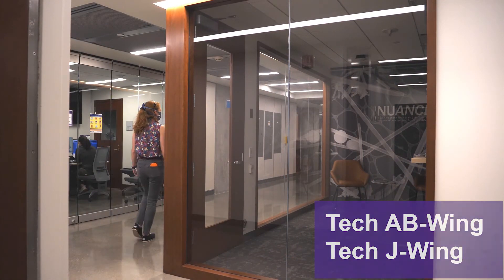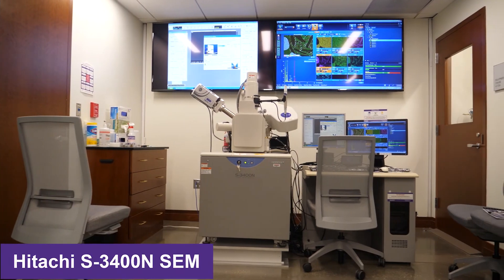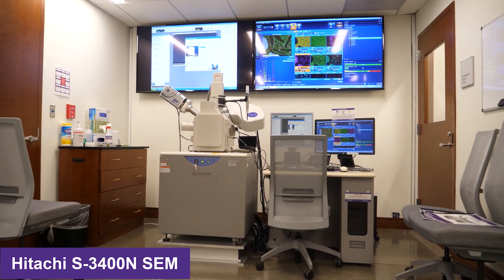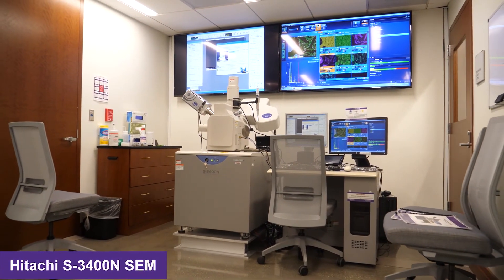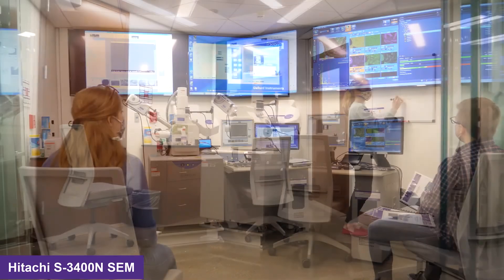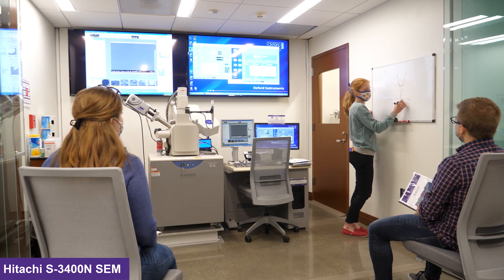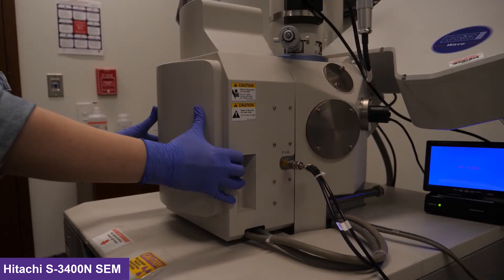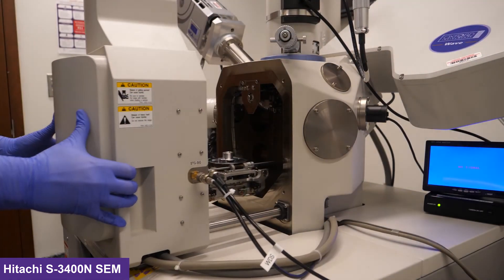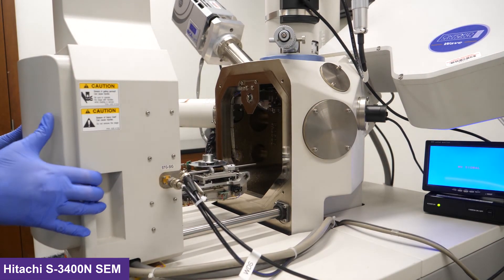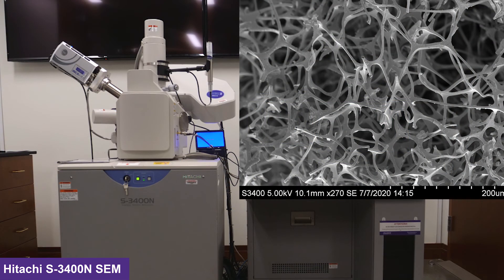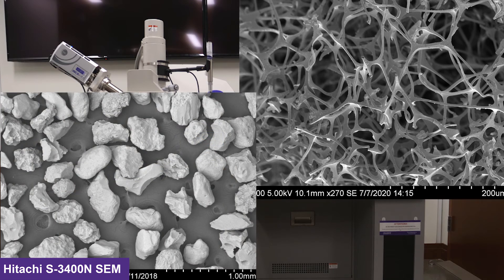When you enter the AB wing on the first floor, the first instrument that you'll see is the Hitachi S3400N. This SEM is our main teaching microscope and makes an appearance in many MSE courses. It has a large specimen chamber to fit large samples and wafers. It is great for imaging larger samples and features down to about 0.5 microns.